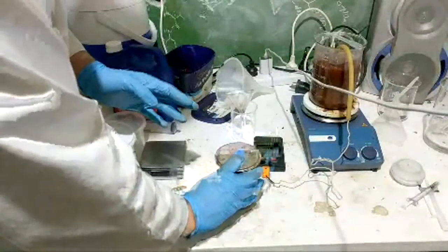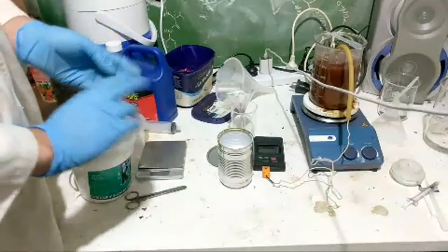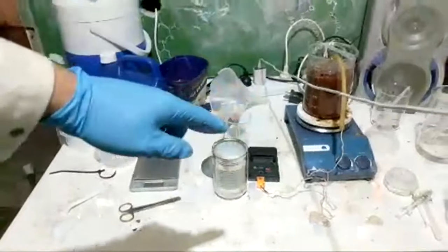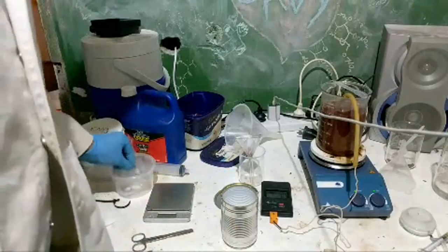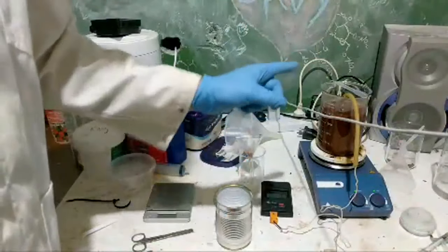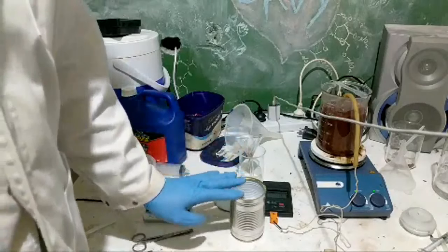We're trying to make high oxidation state iron. I've said that about 12 times, but if you're new, thanks for tuning in. One of the ways we're trying to do it was with bleach here, and the other way we're trying to use potassium nitrate, and we're going to light this on fire. This hypothetically should be better, but we've taken some shortcuts and it doesn't look like it's paying off for us. Which is all my fault. Whereas this should work better, but I think the yields are going to be awful.